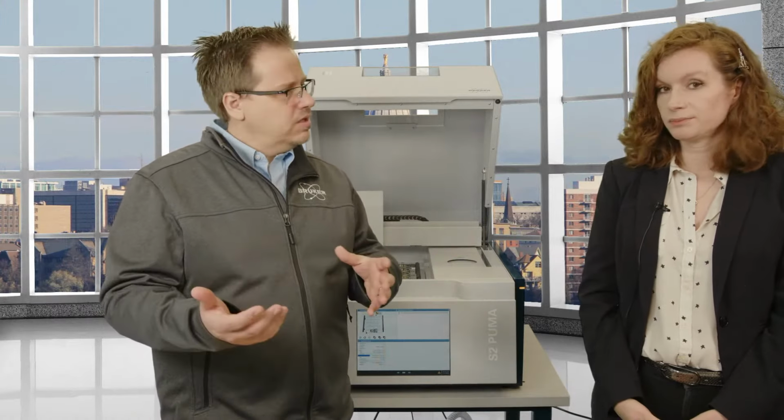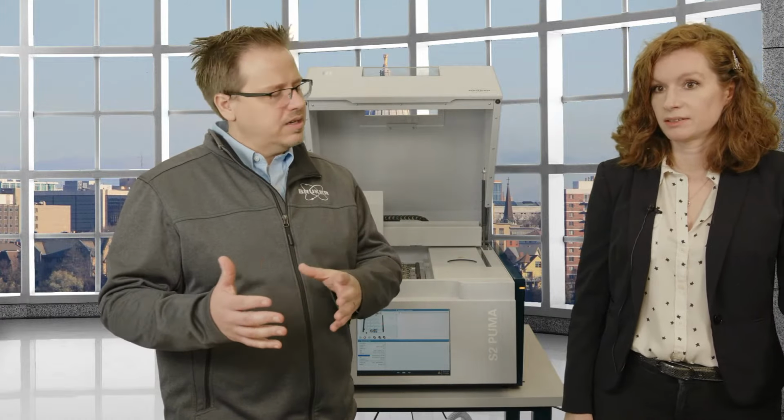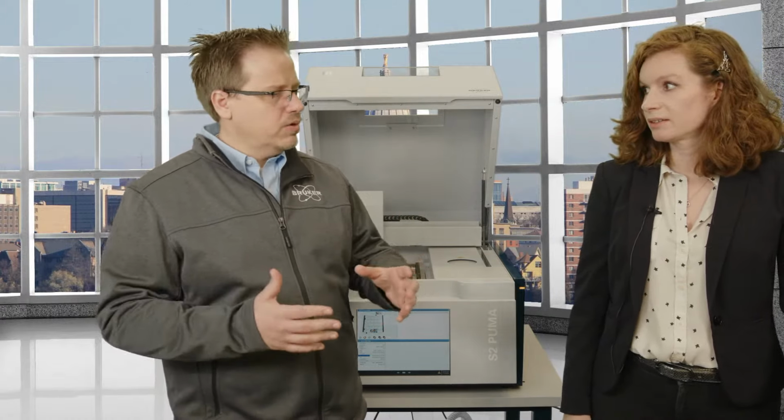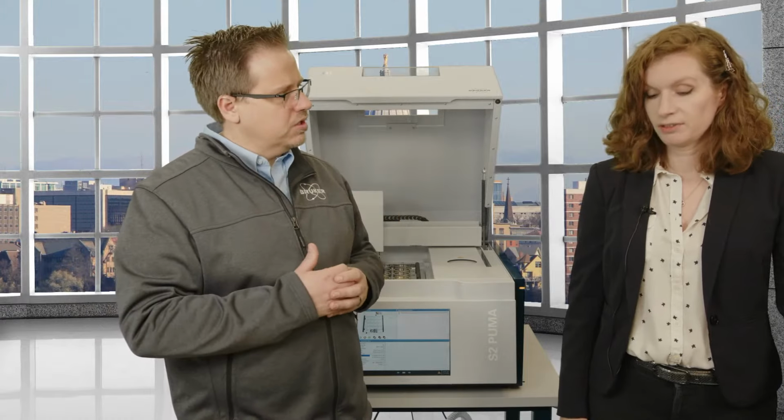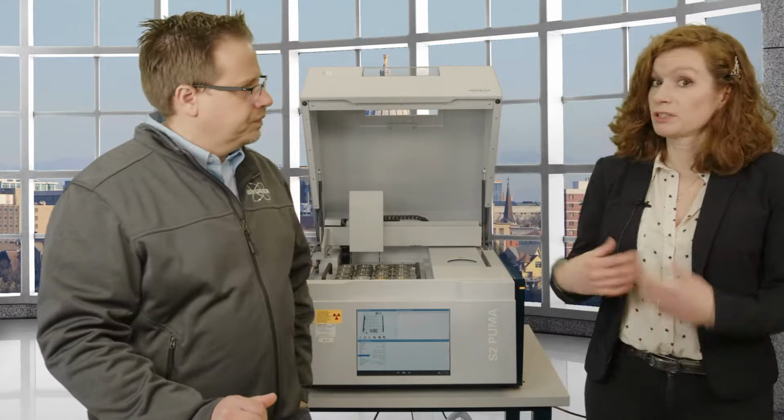Okay, so in XRD, we're kind of using that really characteristic peak of, say, copper, that's 8 kilovolts. But here we really want to just use a very, very high energy to get that excitation. Correct. With EDXRF, it's not so much, but WDXRF uses the same principle as you do, right?